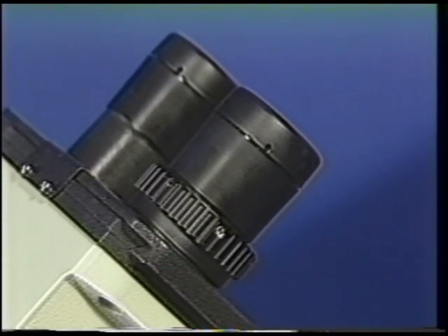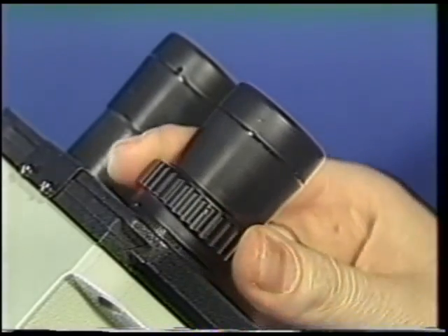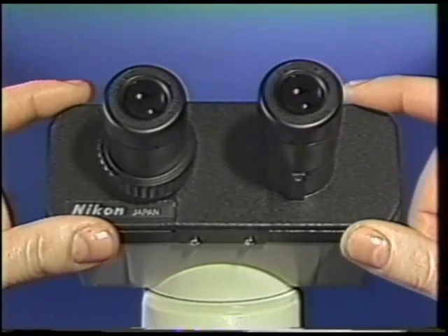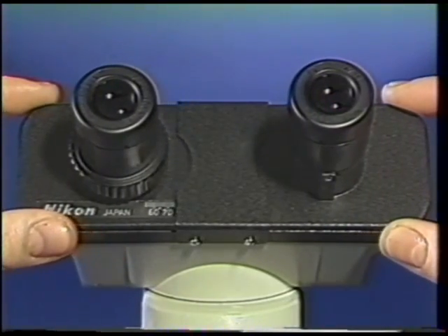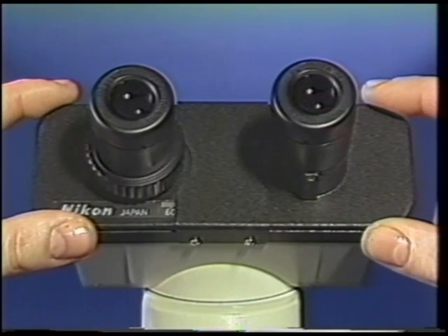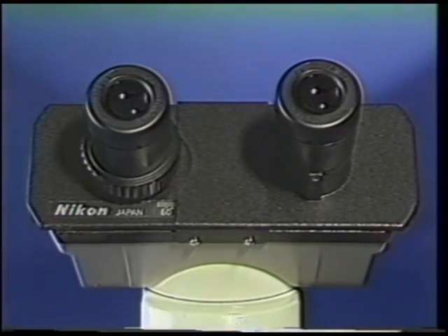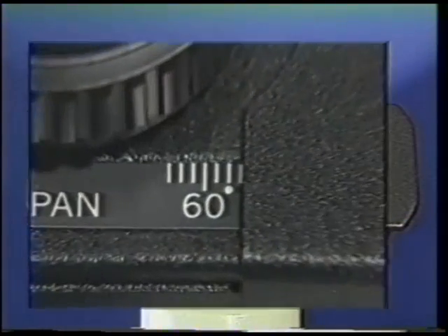To adjust for focusing differences between the left and right eye, adjust the diopter ring on the left eyepiece. The interpupillary distance, or distance between your eyes, is adjusted by movement of the eyepiece tubes. Once adjusted, note the setting on the interpupillary distance scale.